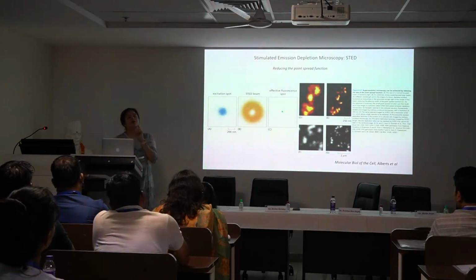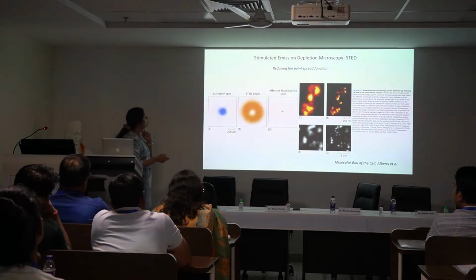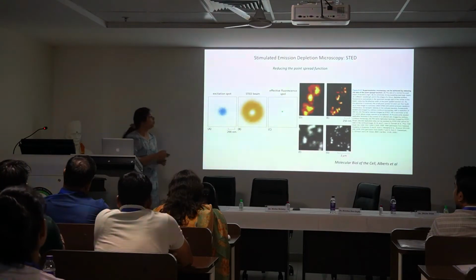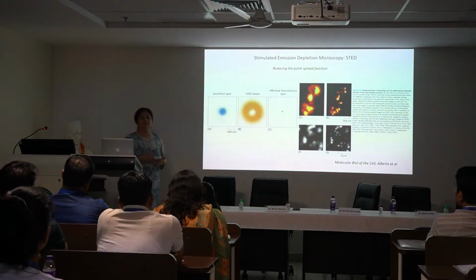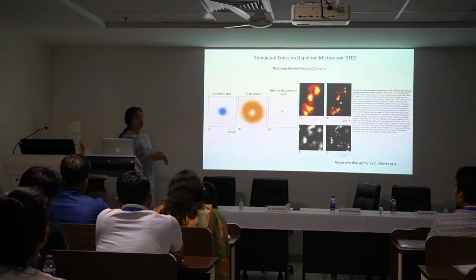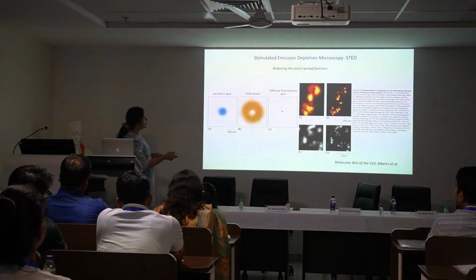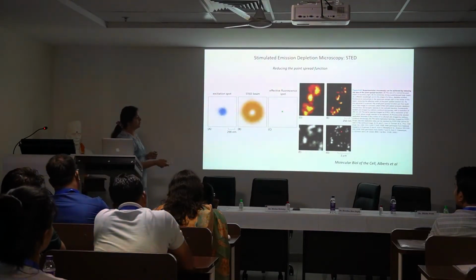So we have to think of good tags, and use fluorophores which can turn into the dark state, so they can be depleted by the depletion lasers in the system. There is a huge amount of information on which kinds of fluorophores one could use. So now one can change the view of a blurry sample to a sharper localization of the same set of molecules.